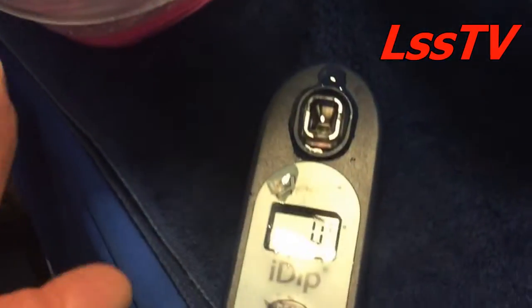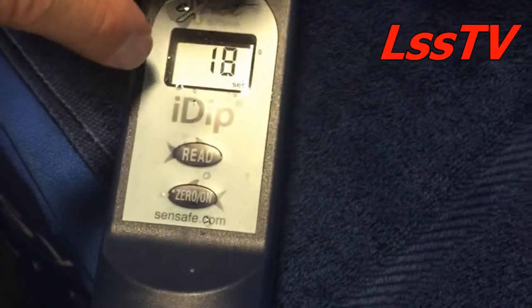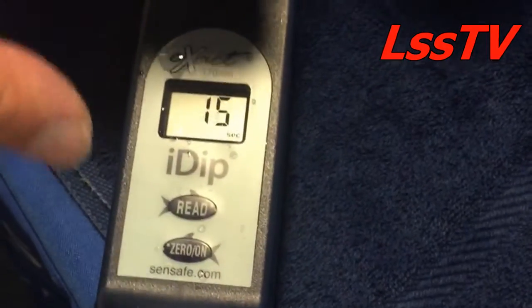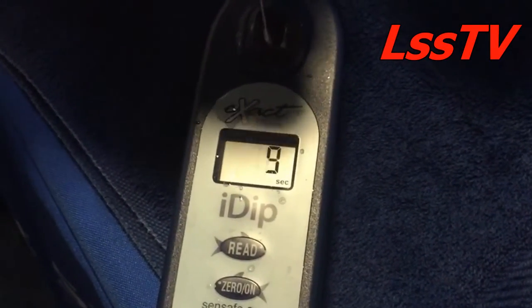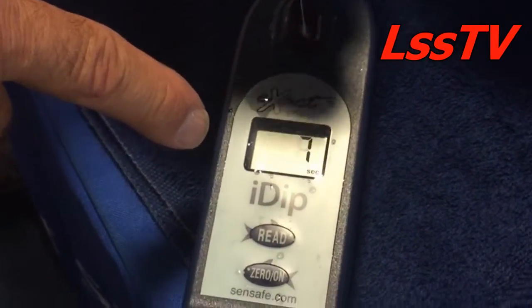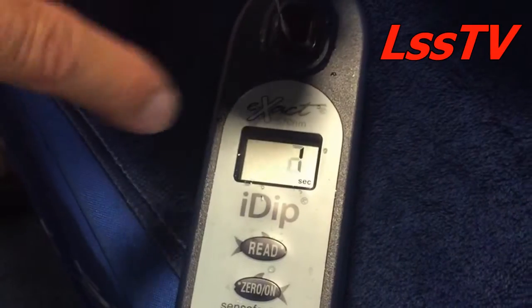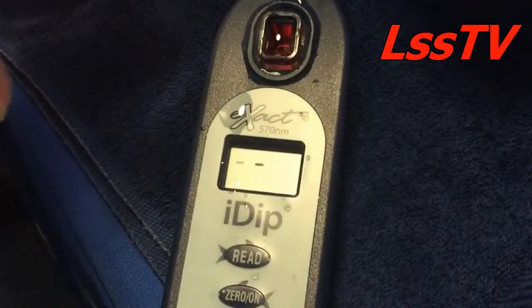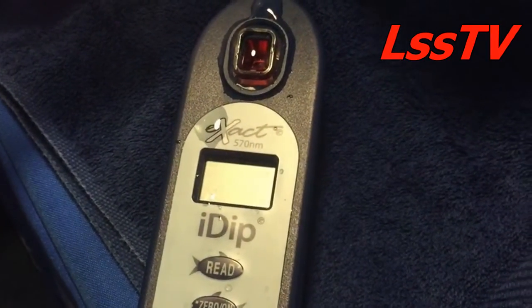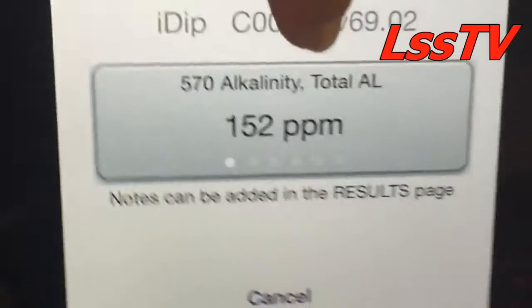This is the reagent strip for alkalinity. I'm ready to do the test. I hit read, put my strip in the little cuvette — 20-second countdown. Most tests are 20 seconds; copper, phosphate, nitrate, and a couple of other tests take longer. You can see it counting down. The chemicals on the strip dissolve in the water, release the chemicals, interact, form a color complex, and the instrument measures the intensity of the color complex. 152 parts per million of alkalinity — that's what we have here.